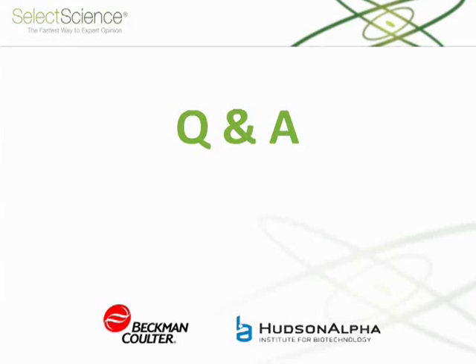Sure. I think that's a good question. I would have a two-part answer. Number one is, nanopore sequencing has been introduced. It's an exciting technology that'll be here in the future, but it is still some time away from solving work that needs to be done today. Specifically in our core facility, or even our research laboratories, we couldn't put all projects on hold for nanopore sequencing and wait for that to come out.